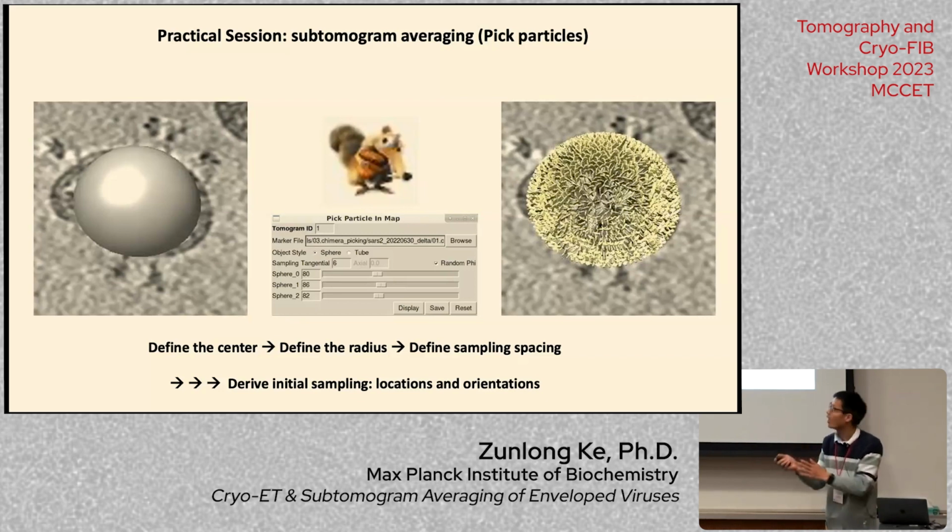Occasionally, you do get points elsewhere, where the spikes just cannot find that one or that one because they're just too far away. So you get points here, but scattered. They won't be clustered. So the first step is to get rid of the ones that are not clustered because they won't be spikes. And after that, you just keep one of the ones that's clustered. I have also set different criteria to do the clustering. But yeah, it doesn't remove your reference.